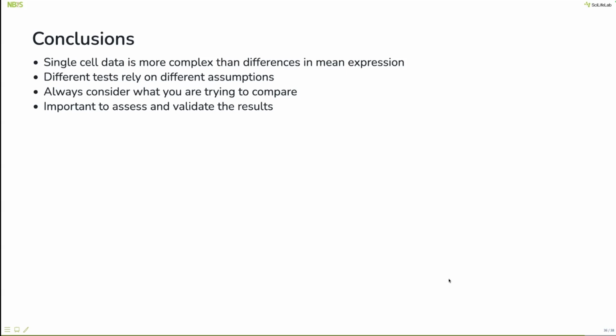Yeah, it's not super straightforward, and I'm not really clear on exactly what kind of design you're talking about now. But it matters whether you have replicates of your different conditions across your batches. If each condition is at least in 2 batches, in your combinations, then you can use complex designs and include both batch and treatment information in your model.